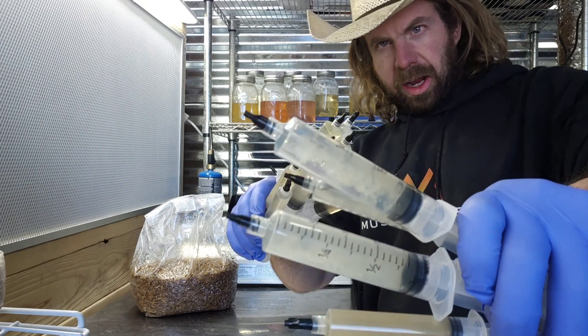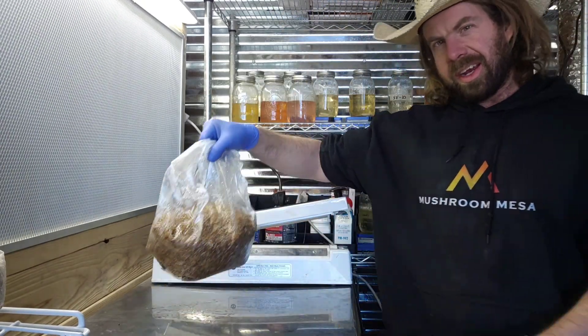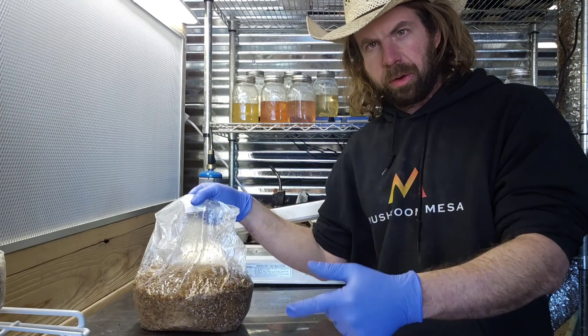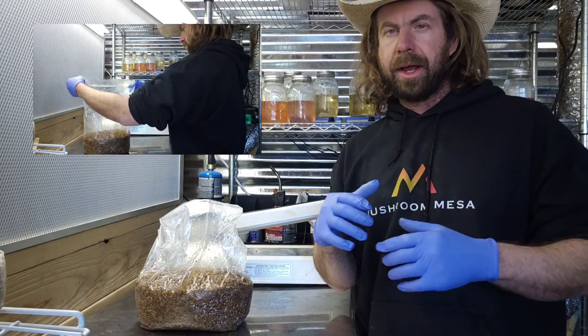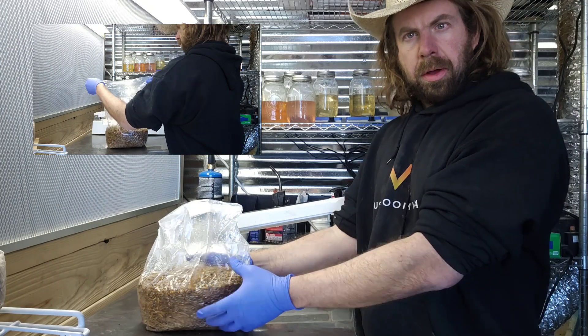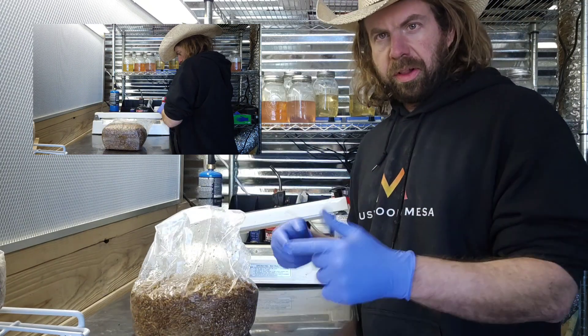What's up guys, Mike here hanging out in the mushroom farm. I've got a bunch of liquid culture and we're going to inoculate some grains. I'm going to show you guys my protocol for how I go about inoculating micro bags — a five pound bag full of grain that I just sterilized — with a liquid culture.